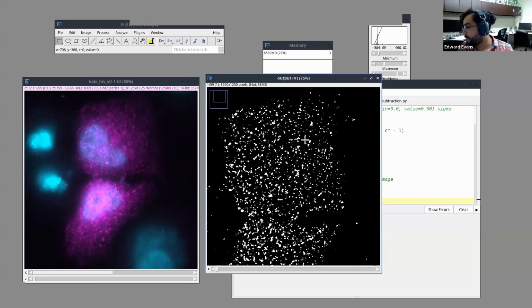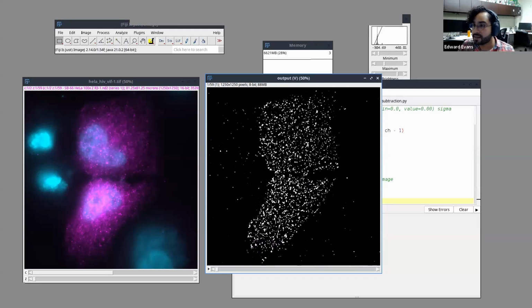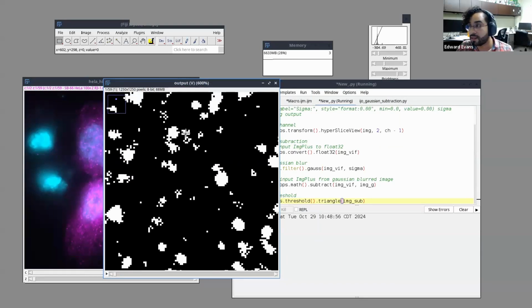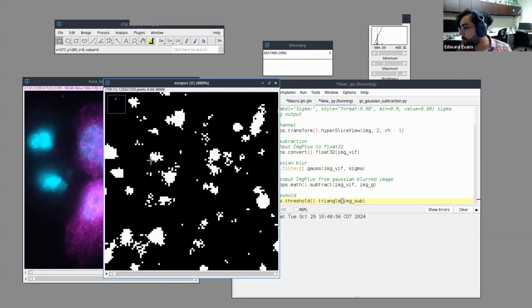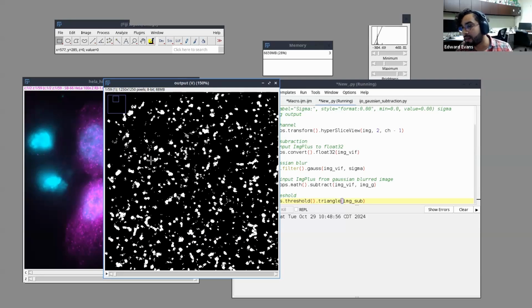This is really nice. Could be better though, right? So we can do some more here. So let's go ahead and label this image. Now, what I would do if we had more time is I would do some erosion here, right? You got a little bit of this, little funny stuff. I would consider doing open, which is an erosion followed by a dilate. That might help clean this up a bit. You can also identify single pixels and try to filter those out. All kinds of different things that you can do at this mask phase to help improve your segmentation.